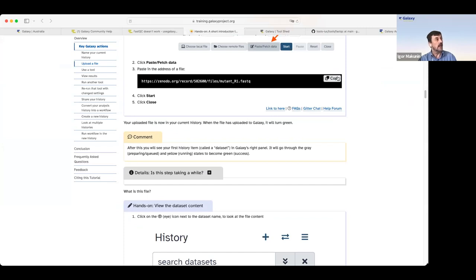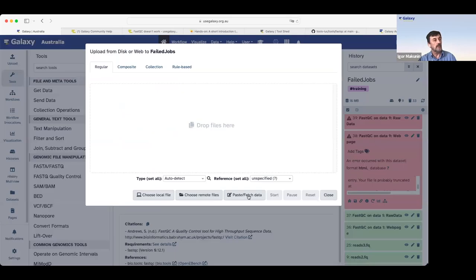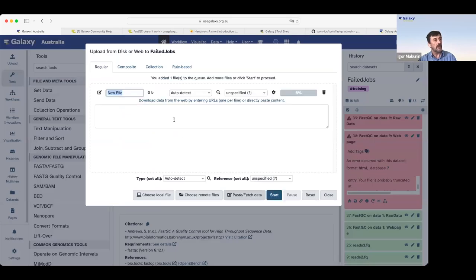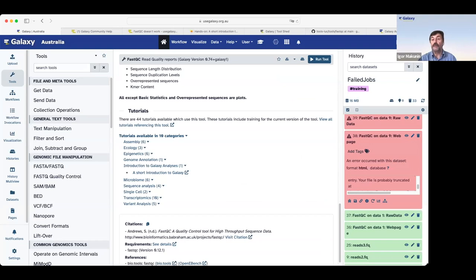go to Galaxy, click on upload menu, switch to paste/fetch data, paste the link, and click start. So you will get test data, and you can try the tool, preferably with default settings, with this small dataset.